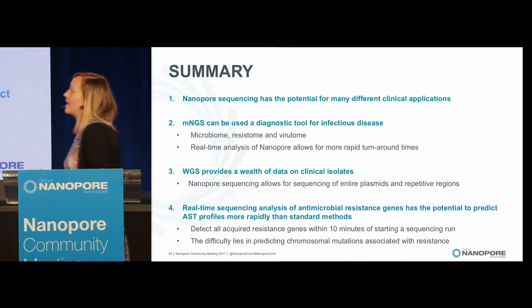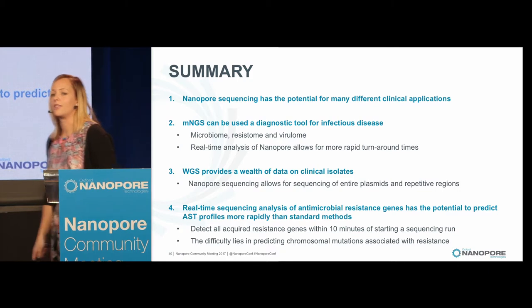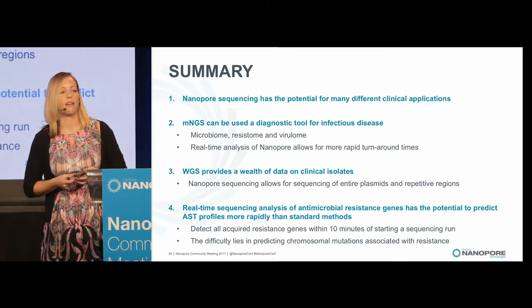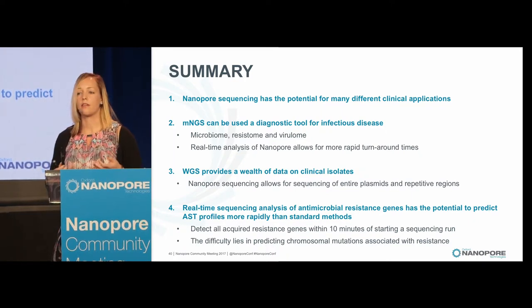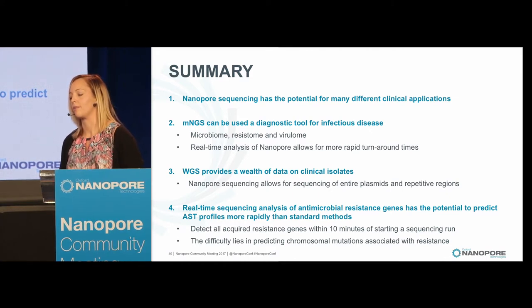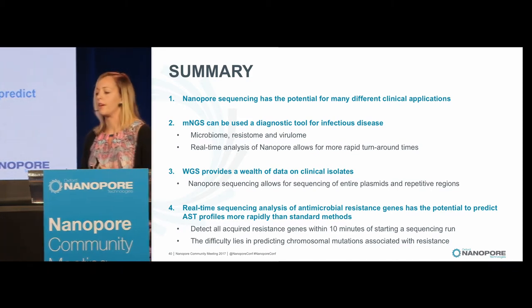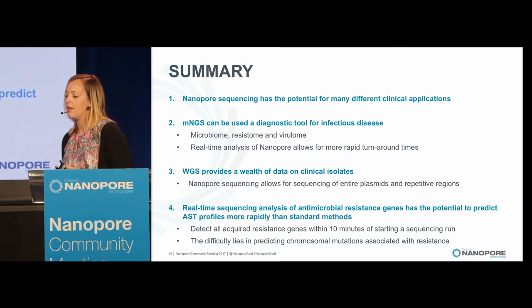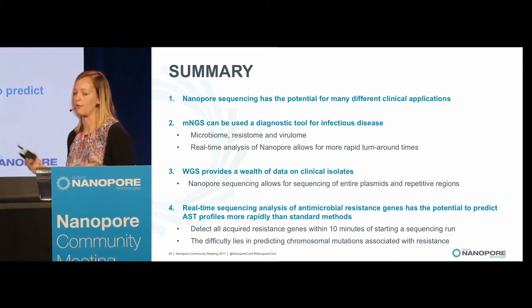So in summary, nanopore sequencing has the potential for many different clinical applications, where metagenomic next-gen sequencing can be used as a diagnostic tool for infectious diseases. And we could also study the microbiome, the resistome, the virulome, and that real-time analysis of nanopore allows for more rapid turnaround times, and this is important as a diagnostic tool. Whole genome sequencing provides a wealth of data on these clinical isolates, where we're able to sequence entire plasmids and sequence around these repetitive regions that we can't do with short read sequencing.